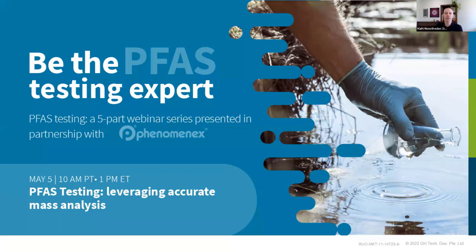I am a market development manager for cannabis, environmental, food and beverage markets here at SciEx, and I will be moderating today's webinar. This is session 3 of our 5-part PFAS testing series. We do have 2 more sessions coming up on June 2nd and June 23rd, so keep an eye out for those if you haven't registered already. Today's session, we're going to be talking about the power of accurate mass analysis and how you can implement that into your PFAS testing programs.